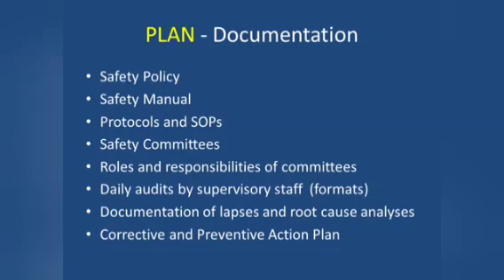Appoint a safety committee. There should be one at the management level and one at the laboratory level. The roles and responsibilities of the safety committee should be defined. At the laboratory level, daily safety audits can be performed by supervisory staff and the results documented in formats.